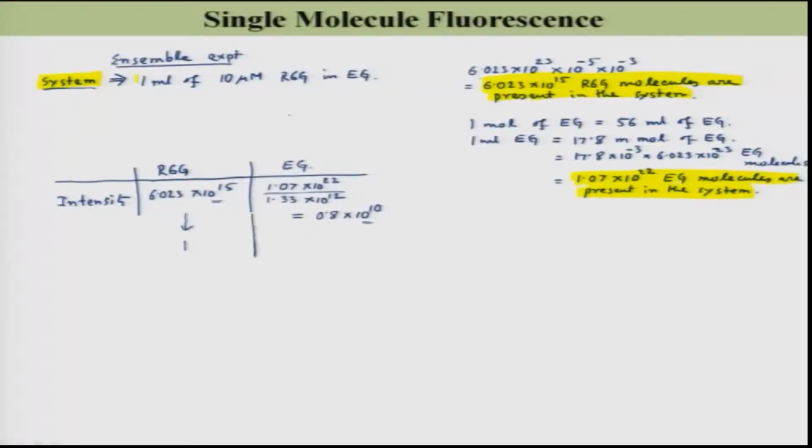So, this emission intensity will be roughly 10 to the power minus 6.